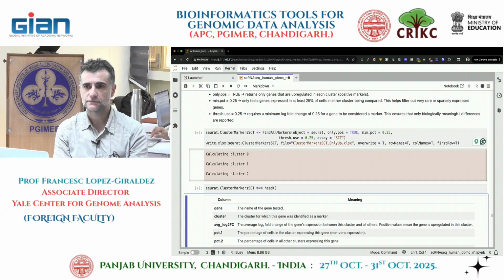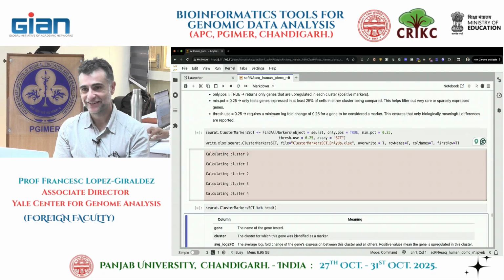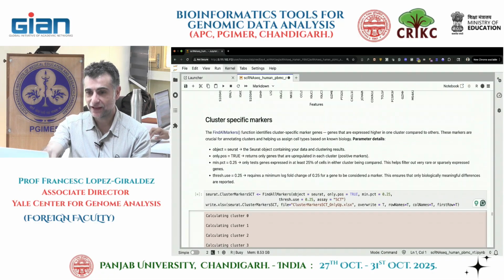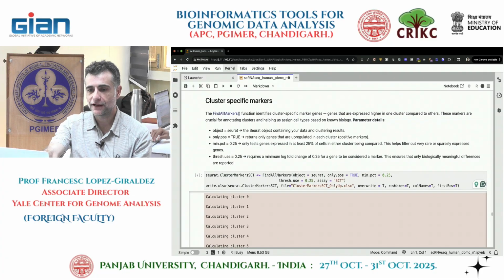What is the meaning of calculating each cluster? What does it calculate? Oh, you want me to explain it now? You're not hungry? No? Okay. So, how is there a cluster 0? What do you mean by cluster 0? Yeah, I'll explain in a second.